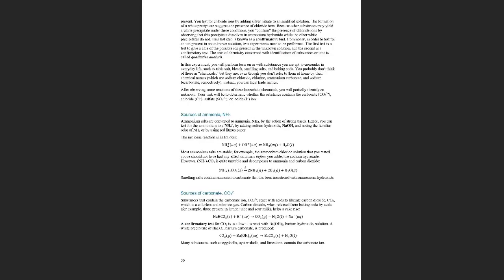So here in the introduction, it's talking about qualitative analysis, and what we just discussed, that in general we need two tests. We need the first one that is going to give us a clue, and the second test is the confirmatory test.